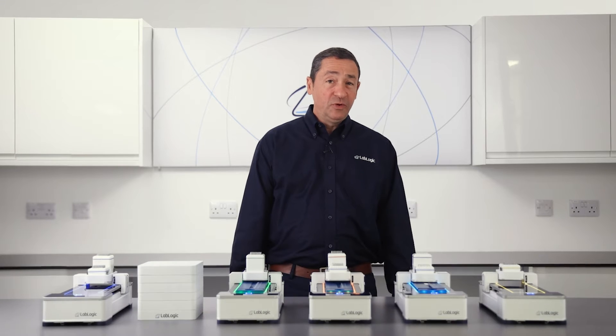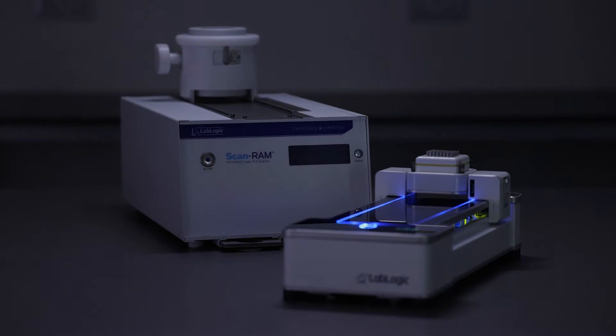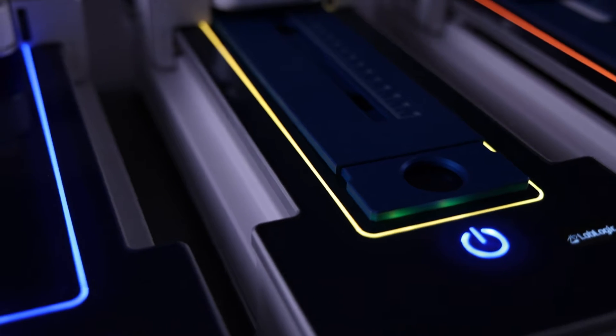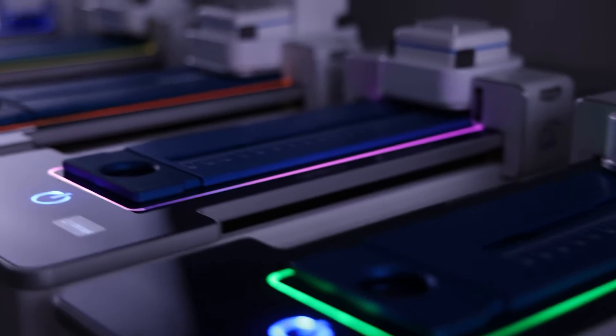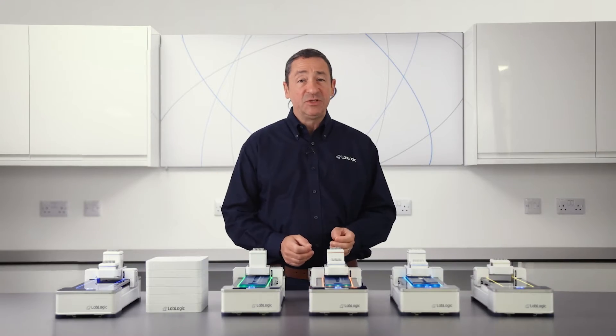Here at LabLogic, we're always looking to innovate and provide customers with unique solutions to improve workflow efficiency and compliance. The latest version of the ScanRAM is the most advanced system available. It includes five different models combining radio TLC scanning, radio HPLC detection, and gamma spectrometry. Let's have a closer look at some of the features and benefits.